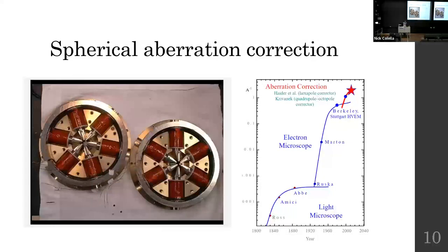That's one that we can do something about on some of our microscopes. Basically, if you spend enough money, you can compensate for this. And the way we do that is we add in a load of compensatory lenses. So if you've seen some of our microscopes, maybe on a tour of our facility, you see that some of the microscopes are actually really, really tall. That's because they've got these extra lenses, whose job is to measure the aberrations and then counter that. And this development, which happened in the early 2000s, has really dramatically increased the resolution of our microscopes.